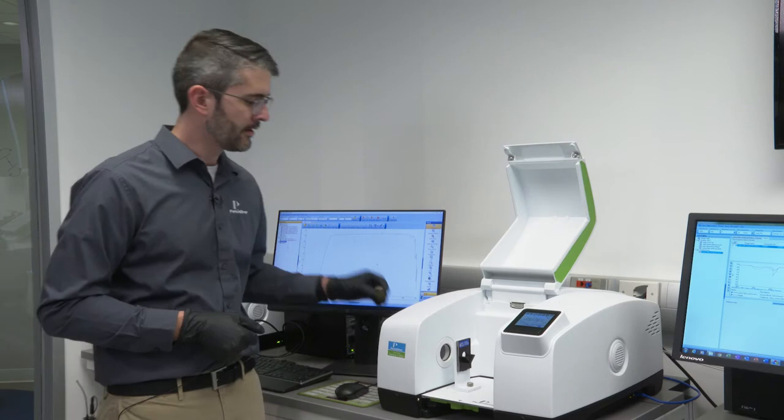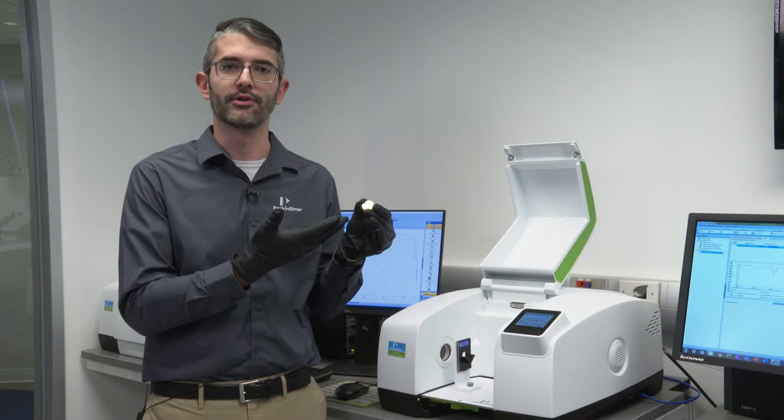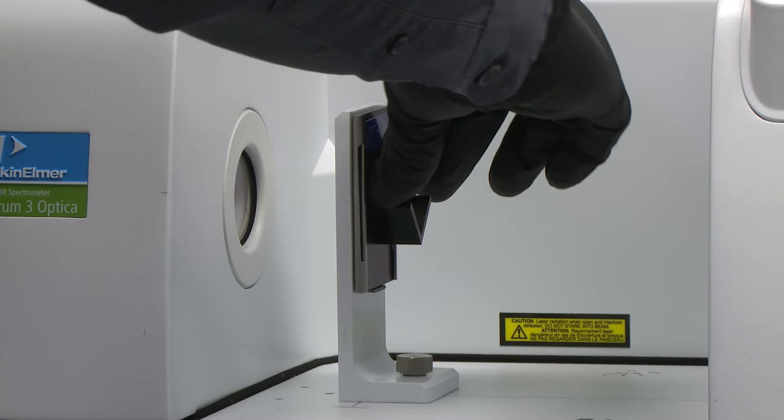You might ask why. Let's take as an example a disk of zinc selenide. Zinc selenide has some modest refractive index, somewhere around 2.4 in the mid-infrared spectral region.